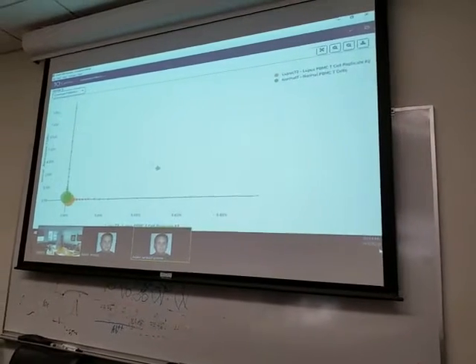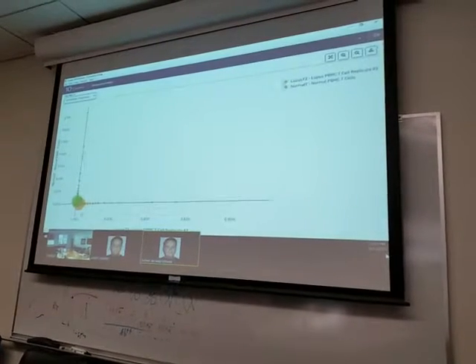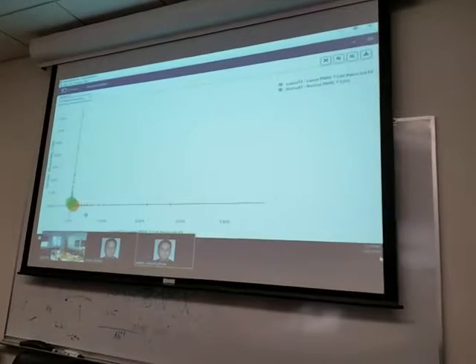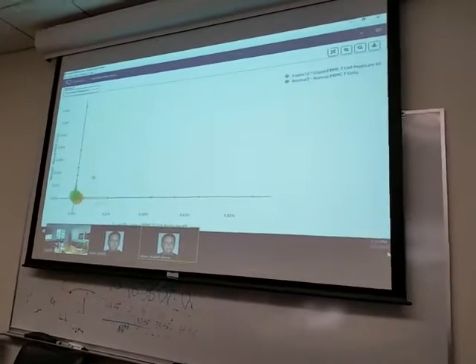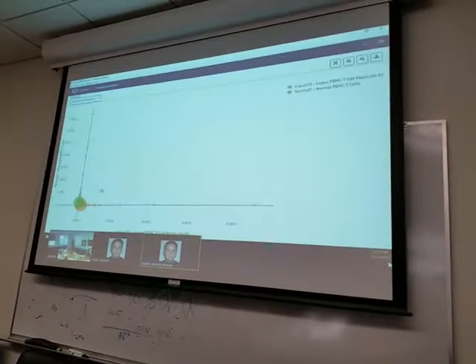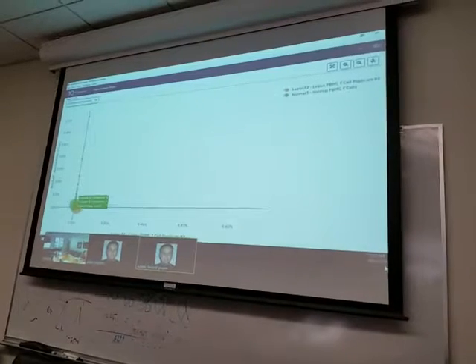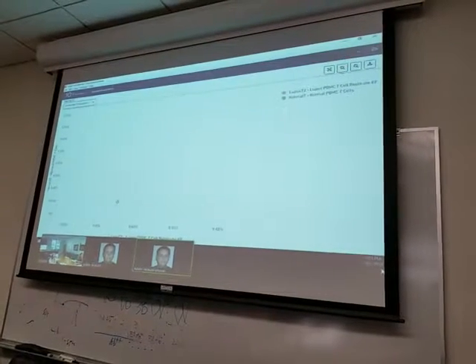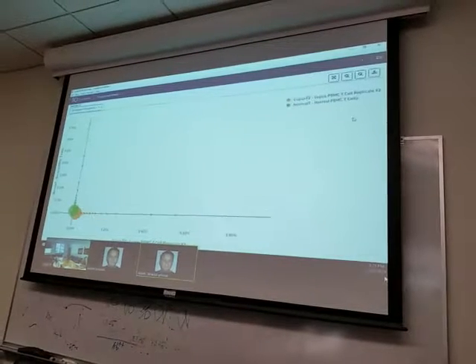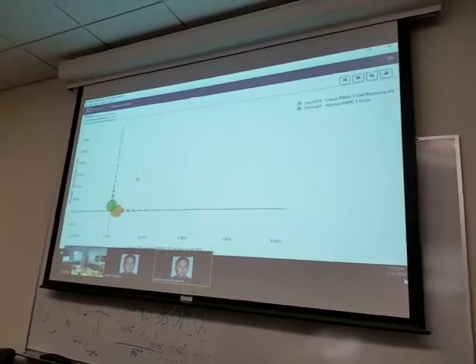Okay. So I can also do it as a kind of a scatter plot, where if we have clonotypes in common, we would expect them to be on the horizontal axis here. So we've got the lupus patient and then the healthy individual, and if we zoom in, we can start to see that they basically have nothing in common there.